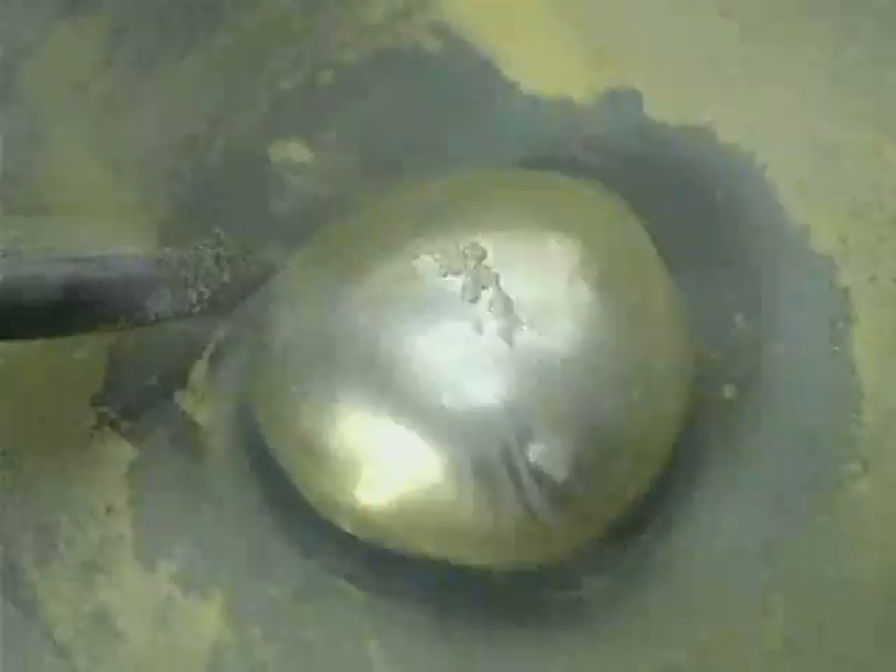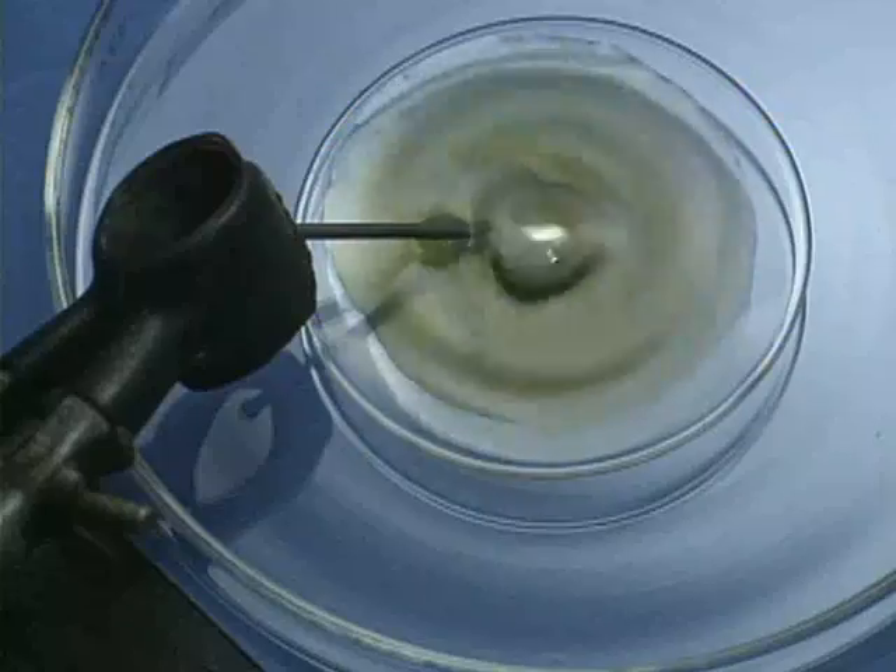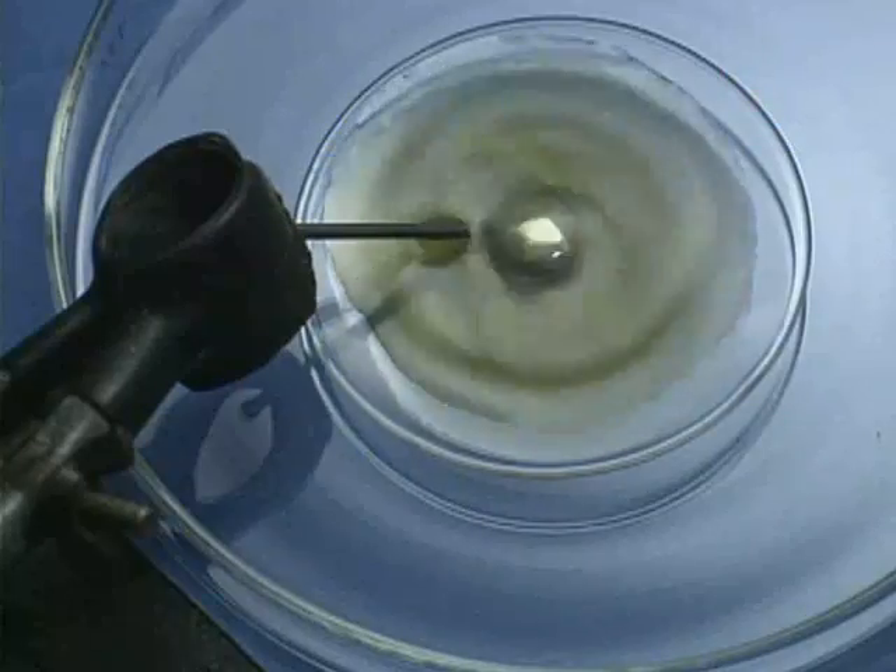The dichromate oxidizes the mercury to mercury-1 ions, which combine with sulfate ions at the surface of the mercury drop to form a film of insoluble mercury-1 sulfate. This film decreases the surface tension of the mercury, allowing the drop to flatten.